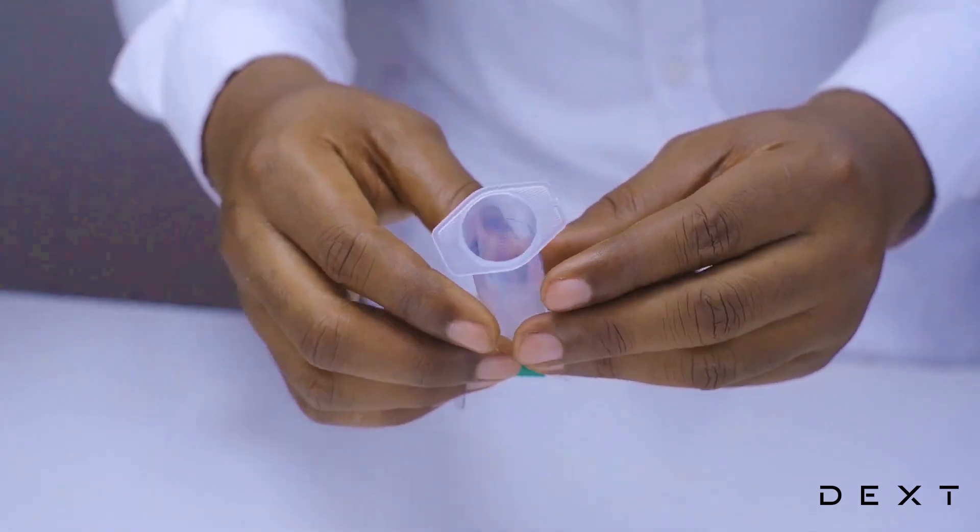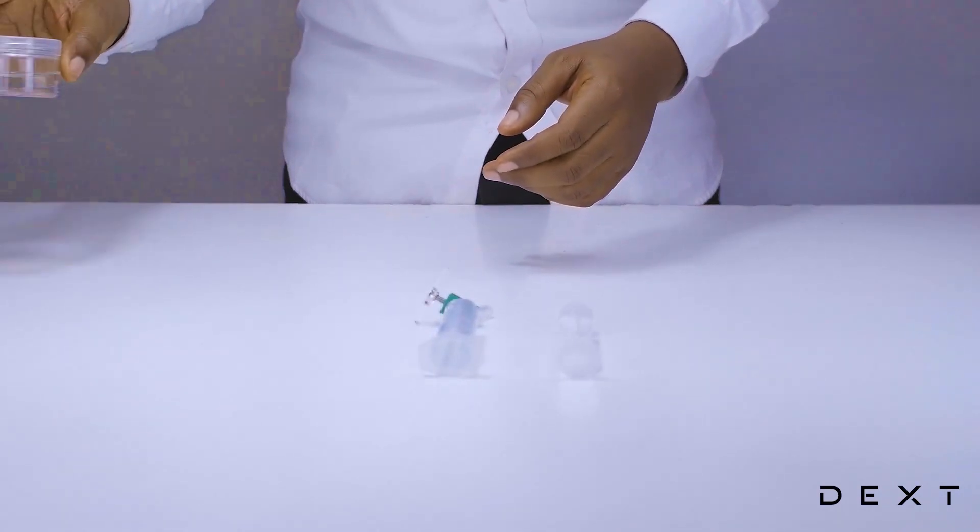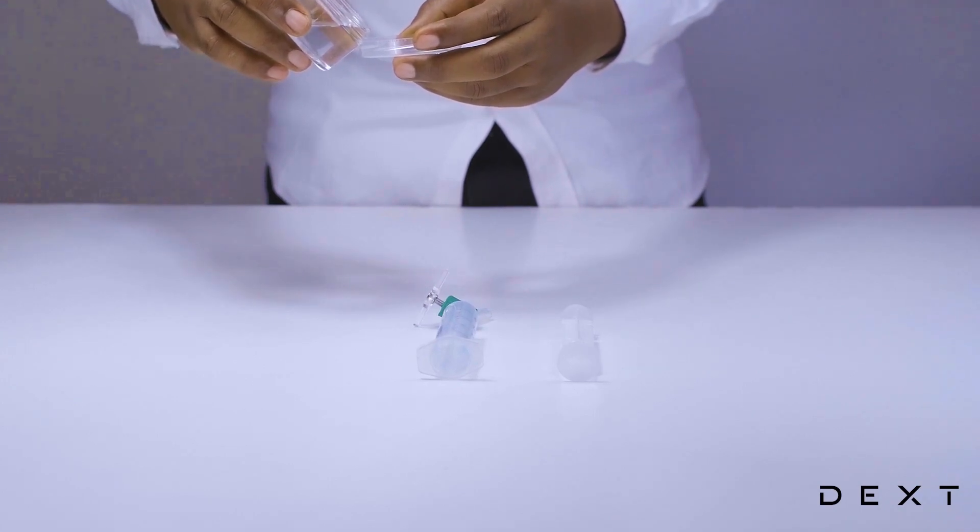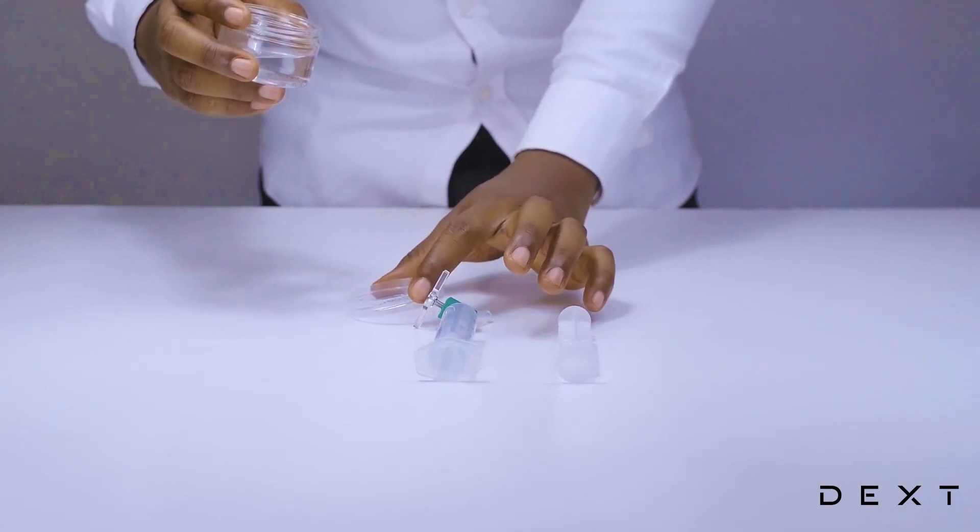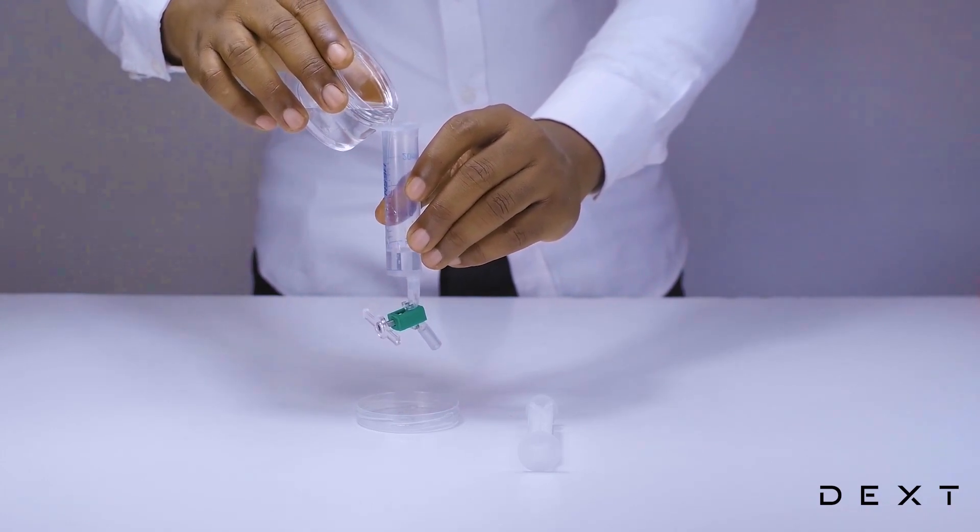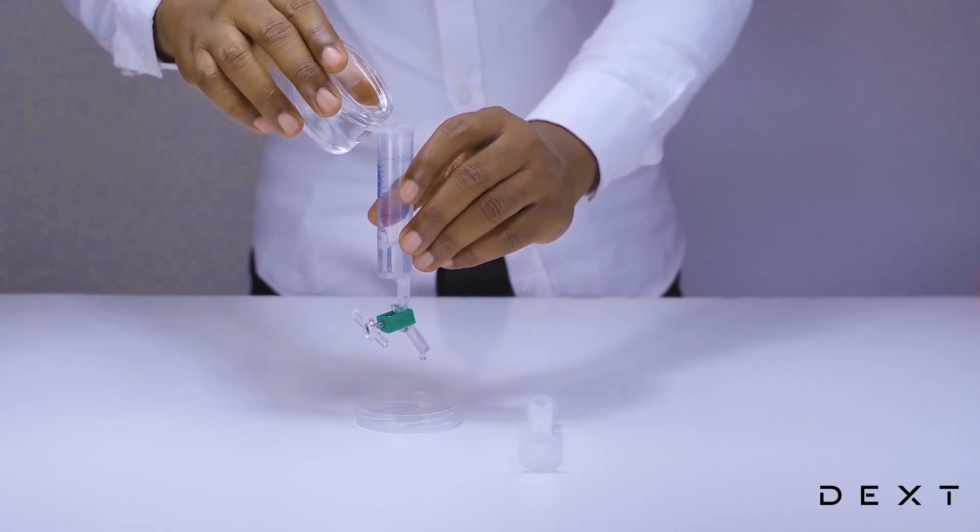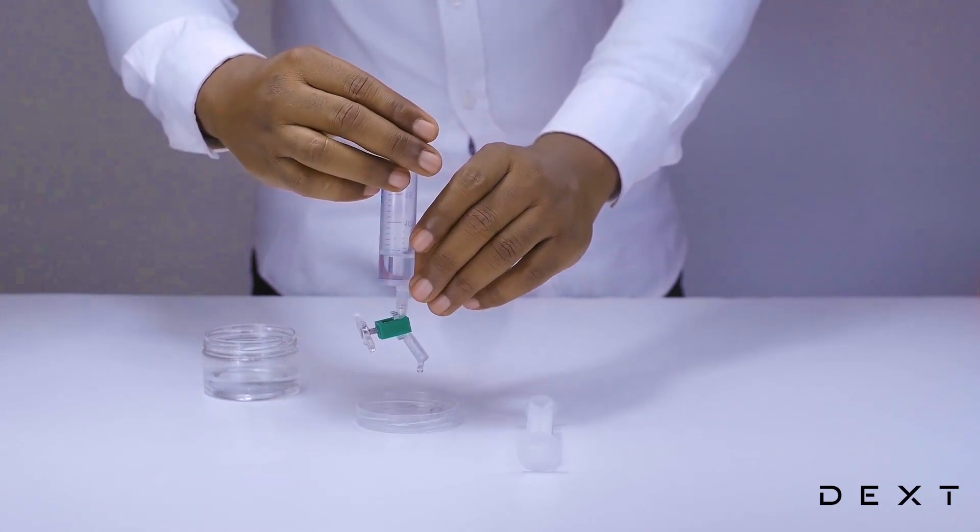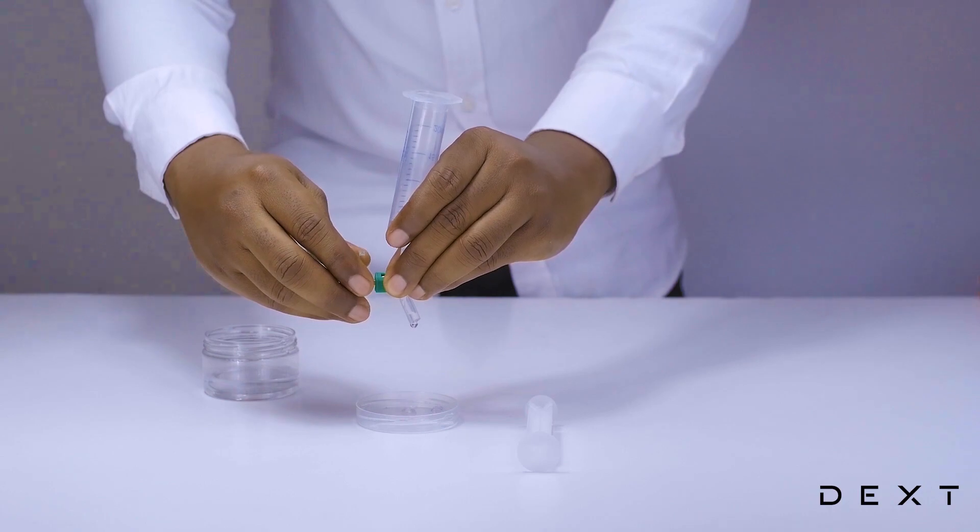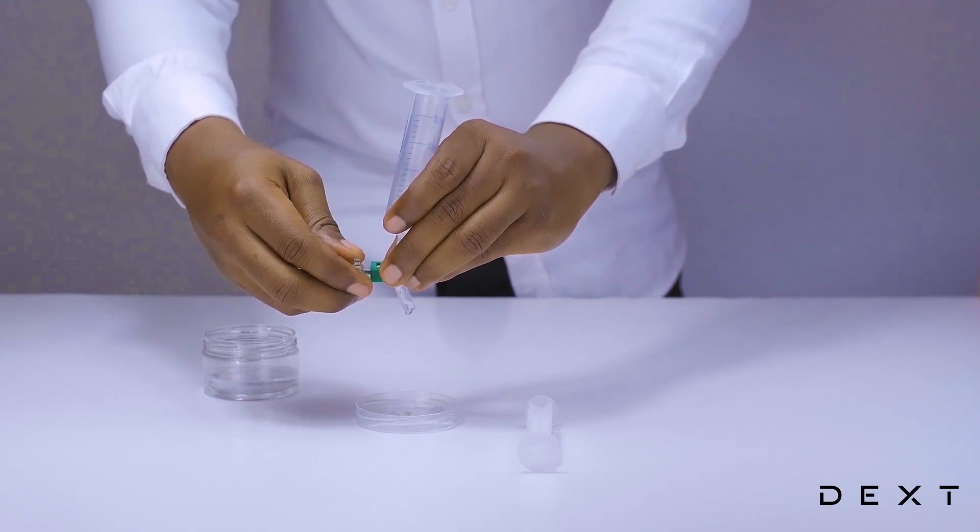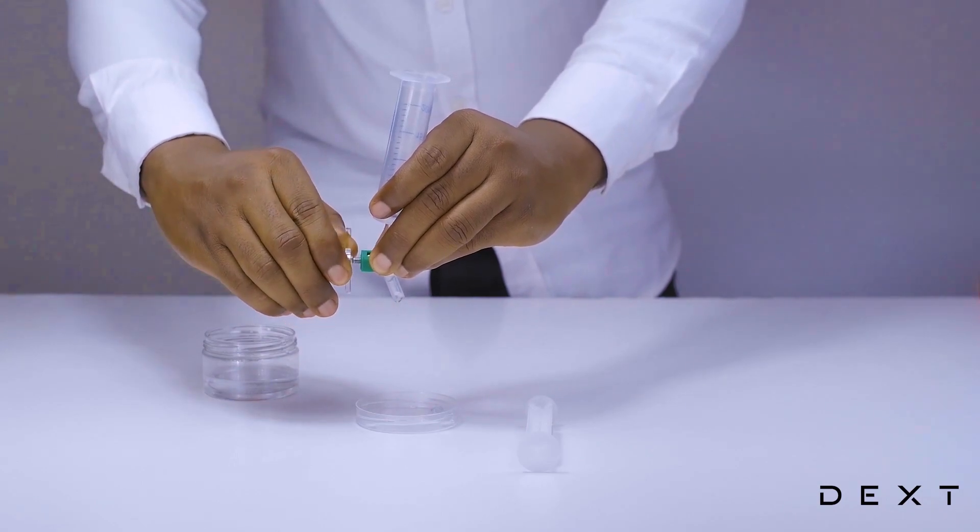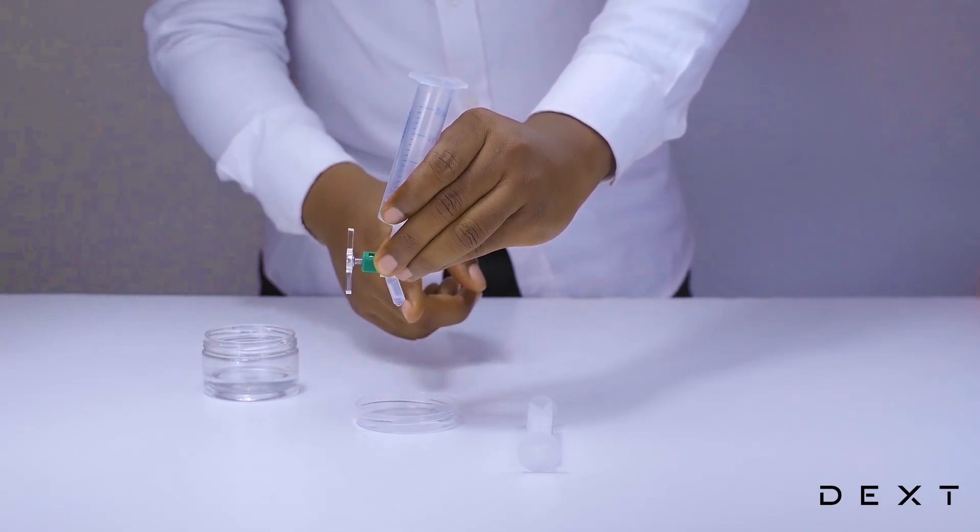The next thing we are going to do is to test our improvised separating funnel. We are going to do that by pouring just a little bit of water through it. We will gently pour some water. It is very likely that you are going to see the water is dripping. No problem. We just tighten our tab a little bit more until the water stops dripping. Again, be careful not to tighten too much so as not to break your plastic piece.